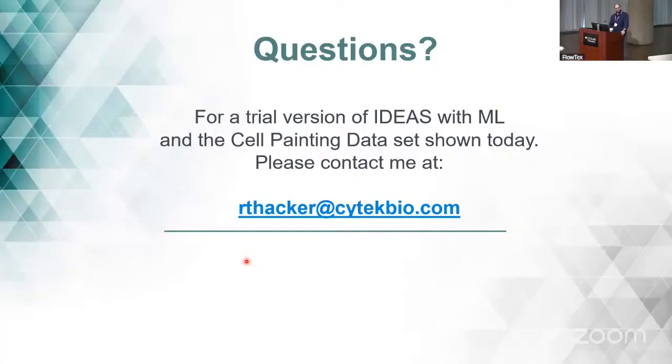Can it come in combination with IDEAS 6.2 version, or do I have to use IDEAS 6.4? You have to use 6.4. 6.3 will work, but the only difference between 6.3 and 6.4 is Cytek branding. So let's just get you 6.4.